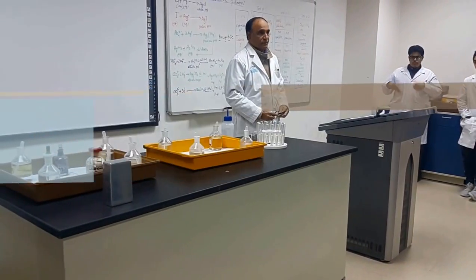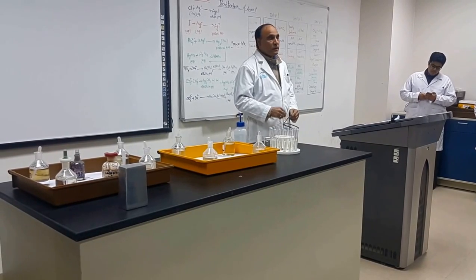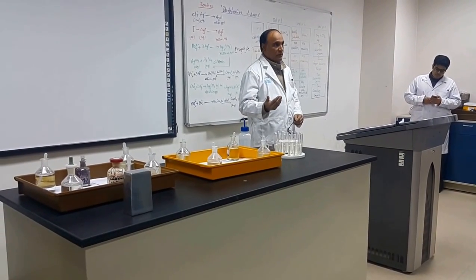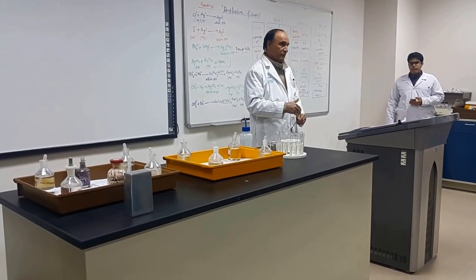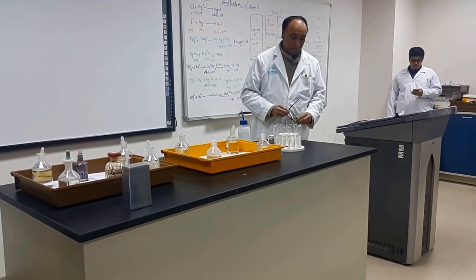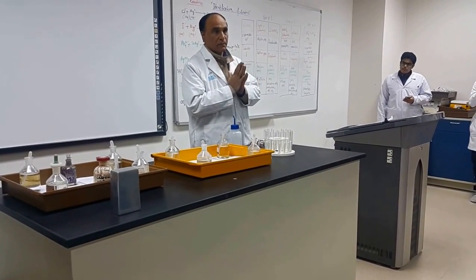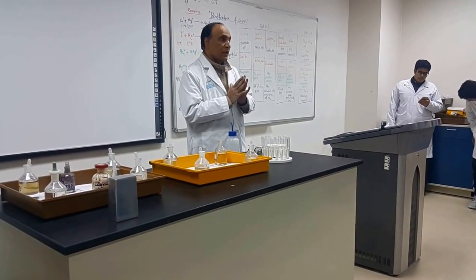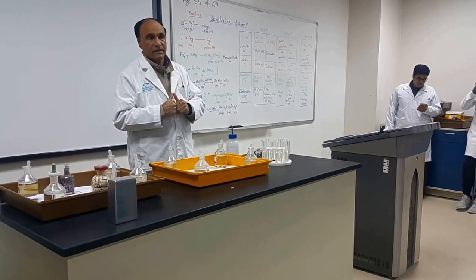Ions. Ion means a charged particle. It could be a positive ion, which is a cation, or it could be a negative ion, which is an anion. There are hundreds of ions present, hundreds. And there is a systematic way to do the analysis.